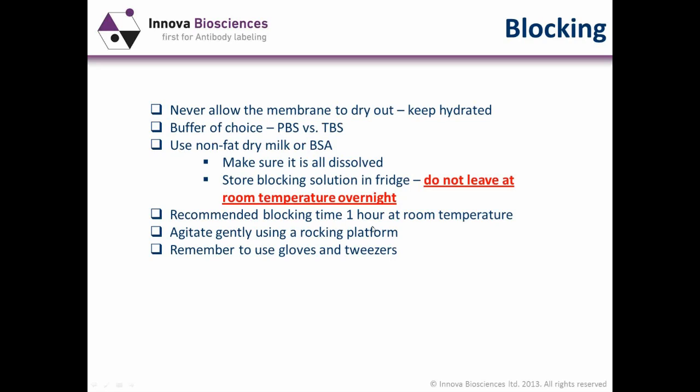My recommended blocking time is 1 hour at room temperature. And don't be tight with your blocking solution. All it is is salts and some non-fat milk. It's not expensive reagents, but your time is more precious to you.